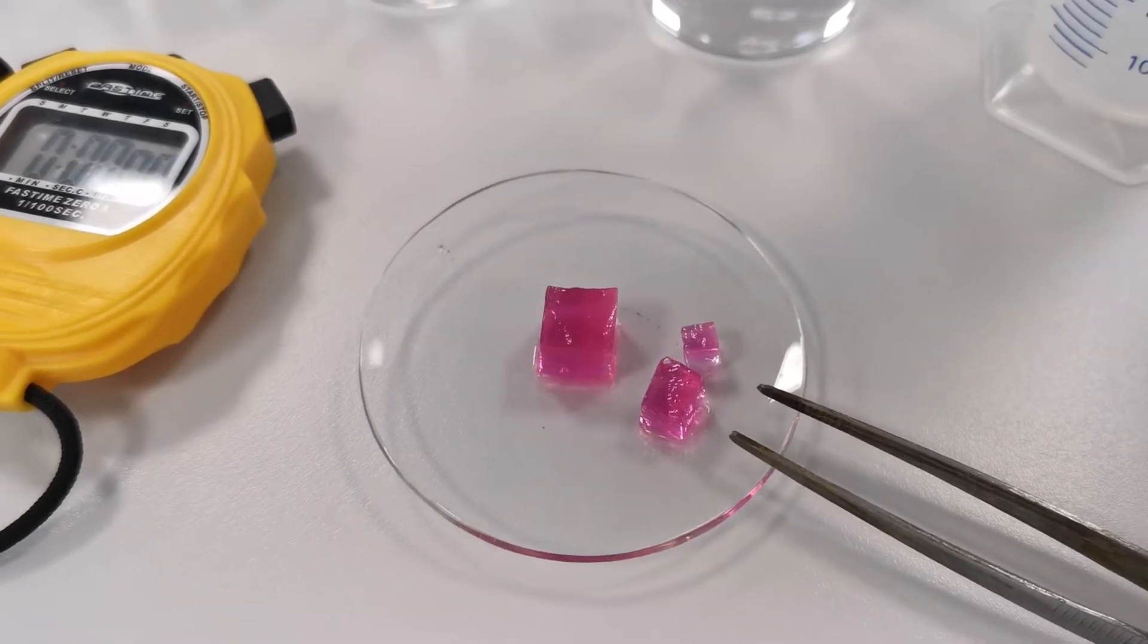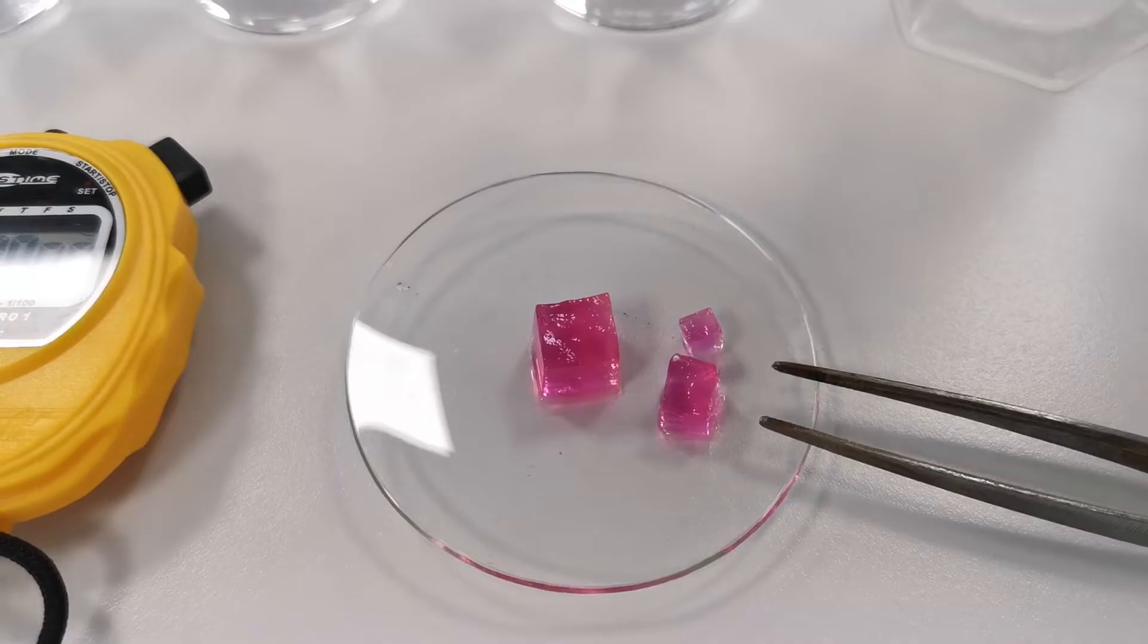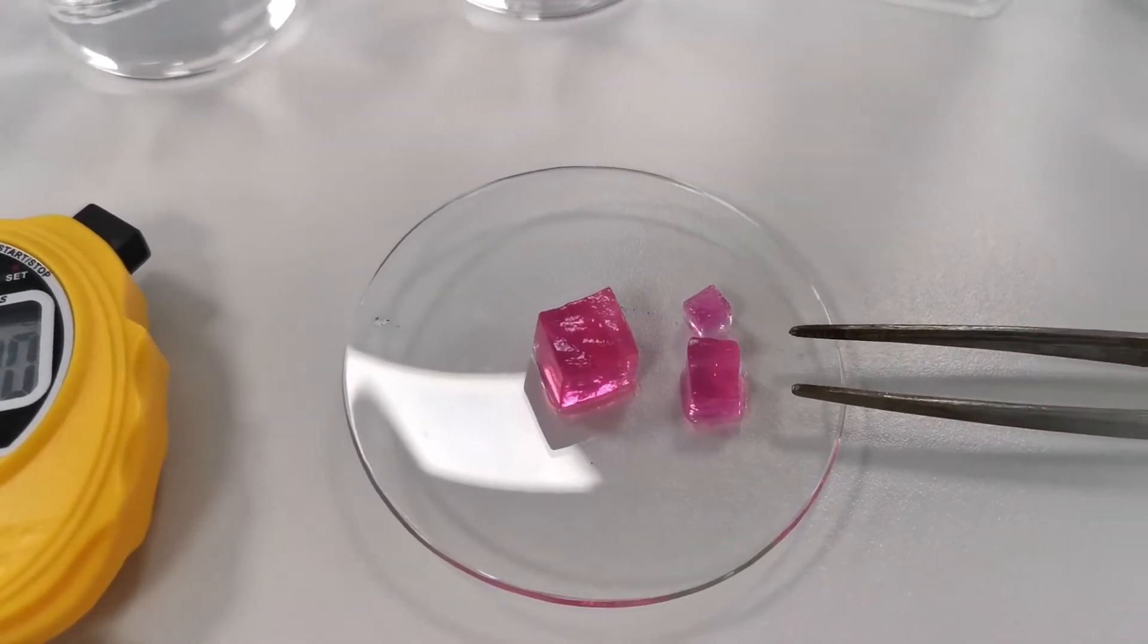As you can see we have three agar cubes here, small, medium, and large. Each cube has the same composition, they all contain phenolphthalein, but they differ in size.